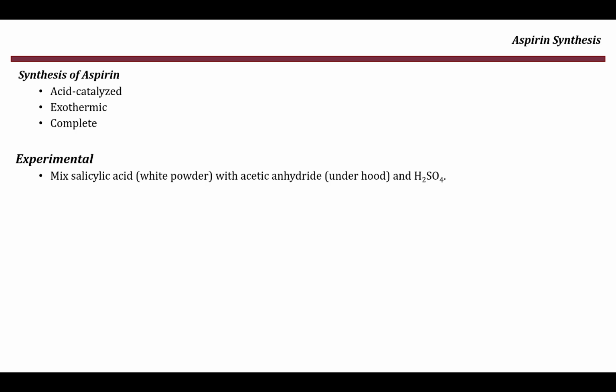Synthesis of aspirin using acetic anhydride. This is an acid catalyzed esterification reaction, so we will be using H2SO4 as a catalyst. The reaction is exothermic. It produces heat, and the reaction is complete, so it's not a reversible reaction.